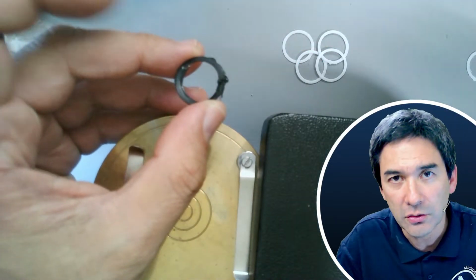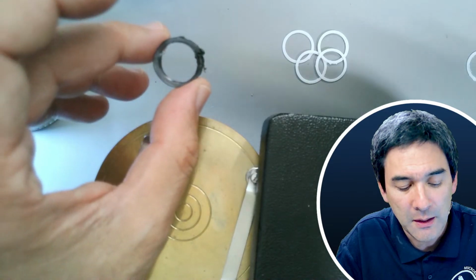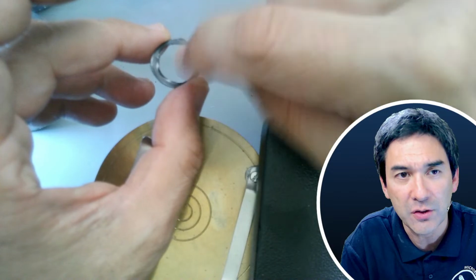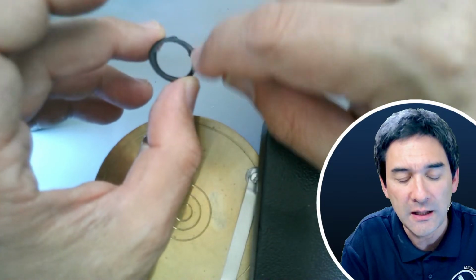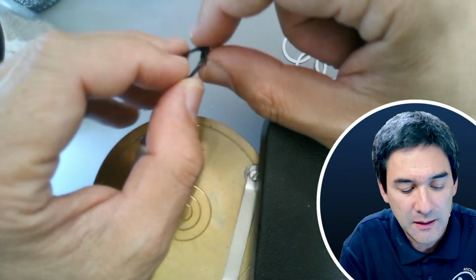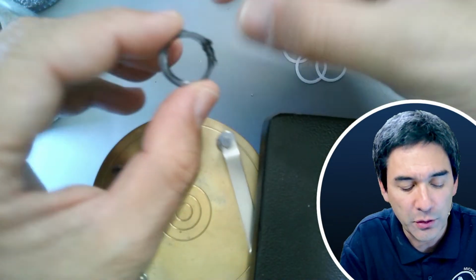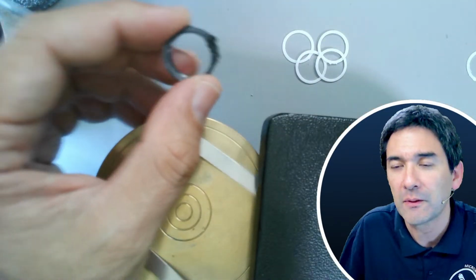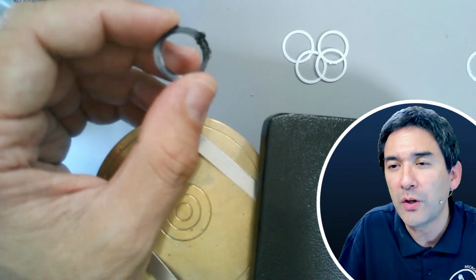But in Cura, that's the 3D printing program, there is also an option. You have to make a tick to iron it out. Basically, it moves over the surface again to smooth it out. It's only a check mark that you have to set, and this makes it smoother, but otherwise you have to use a sharp knife to scratch off the surface.